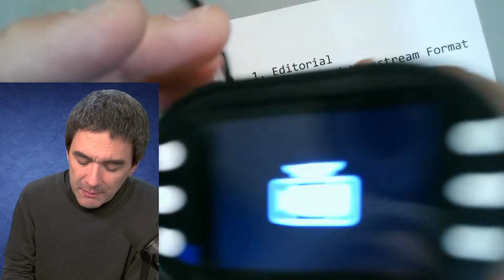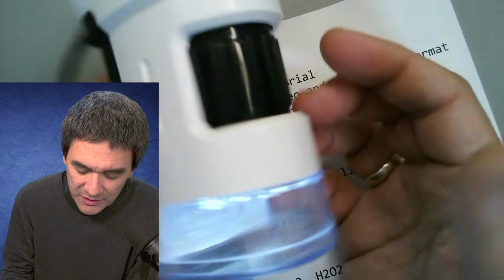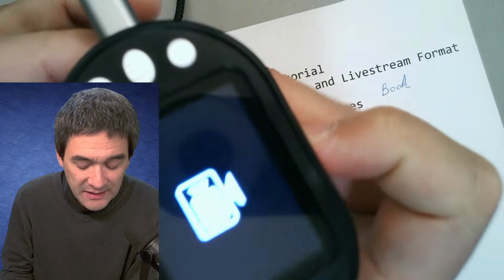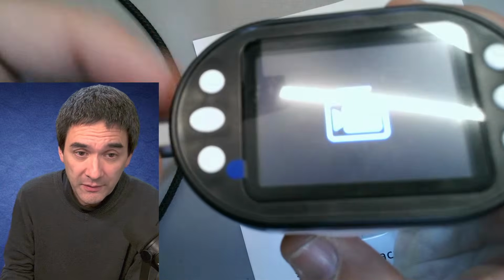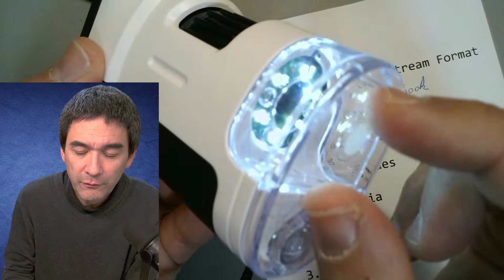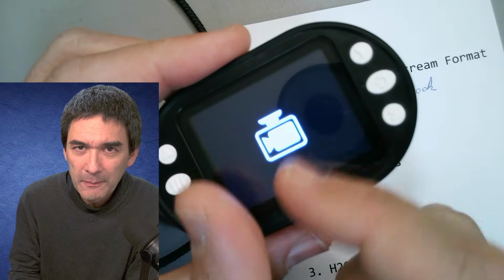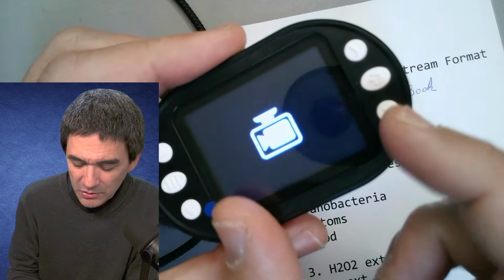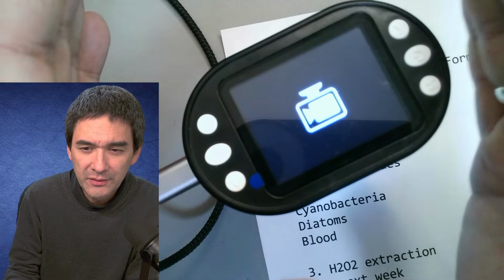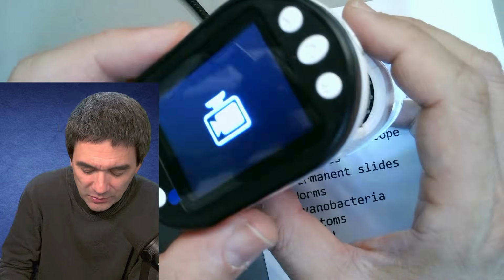The reason, and that's my main criticism of this here, well, for 29 euros, I don't expect a lot, right? I mean, it's reasonably nicely made, it's reasonably solid, but there's one thing that really disturbs me, and I'm going to show you later maybe when I have the USB disconnected, and that is that it gives you a 16:9 format, but this one over here is 4:3. So basically it's cramped together, it's distorted, and for me that's a no-go. So basically the screen is supposed to be wider, but it's kind of compressed together, right? So this is something that I think is just, I don't know, sloppy, or yeah, I don't know.